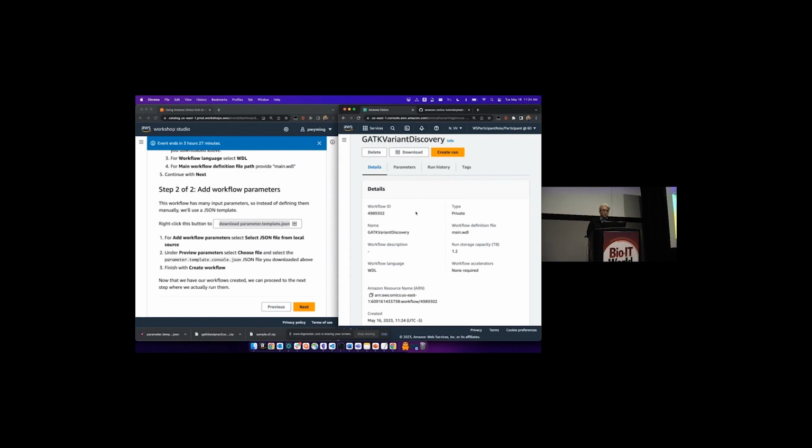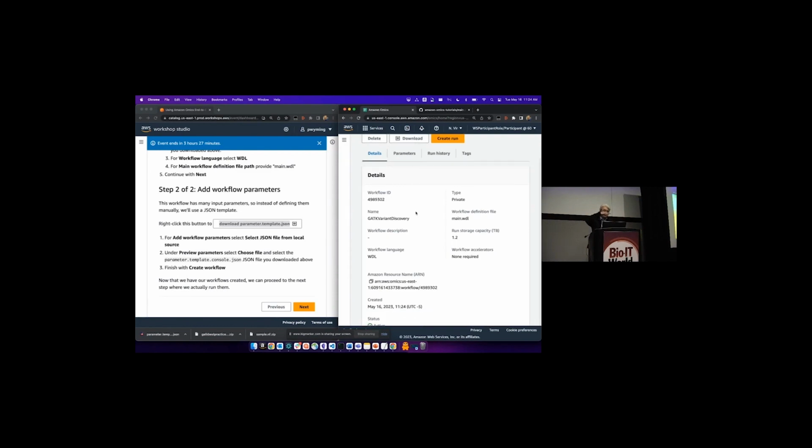Is it just a little thing underneath the box? Or sorry, I think you can go ahead with that. I've had a similar issue. Can you still move forward through the flow, or is it blocking the flow? Well, we can't upload the file. You can't upload the file, period. But I can try to unzip it. Can you click next? What happens?